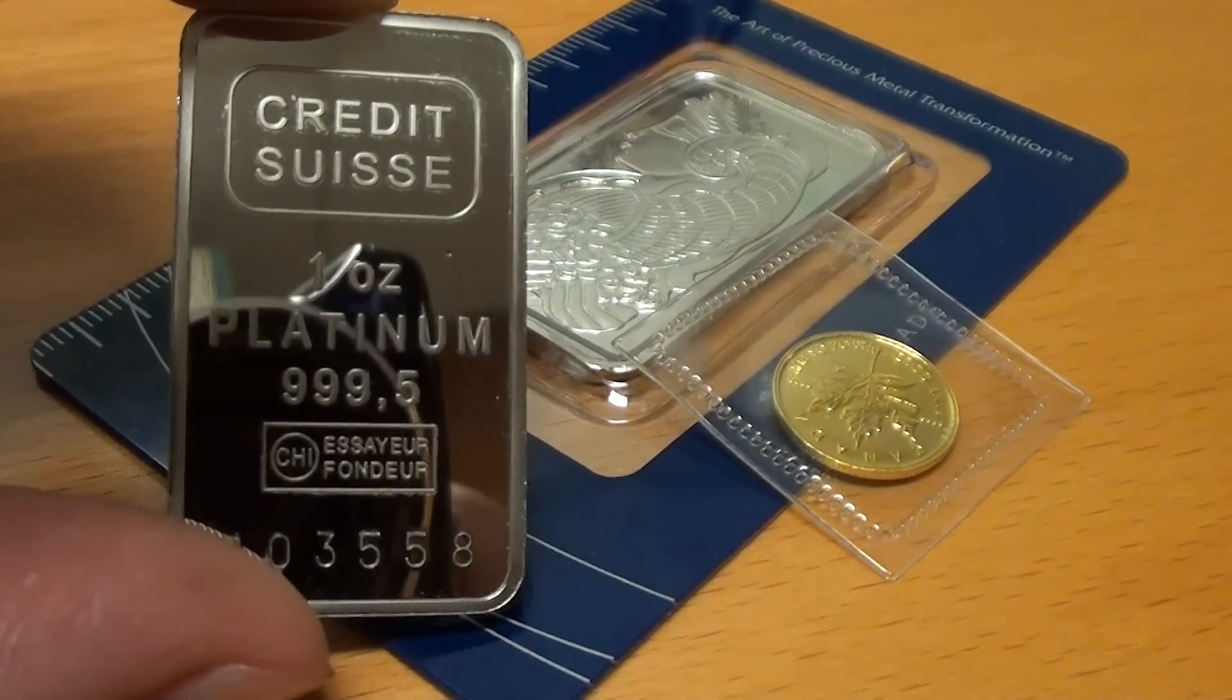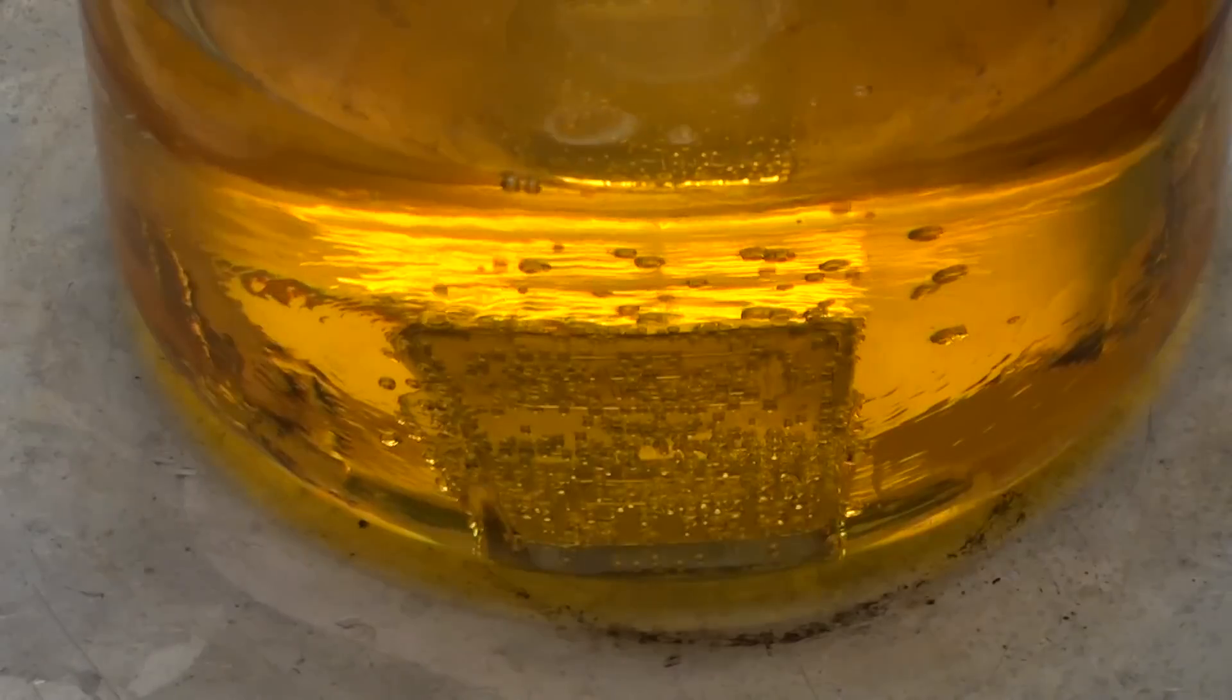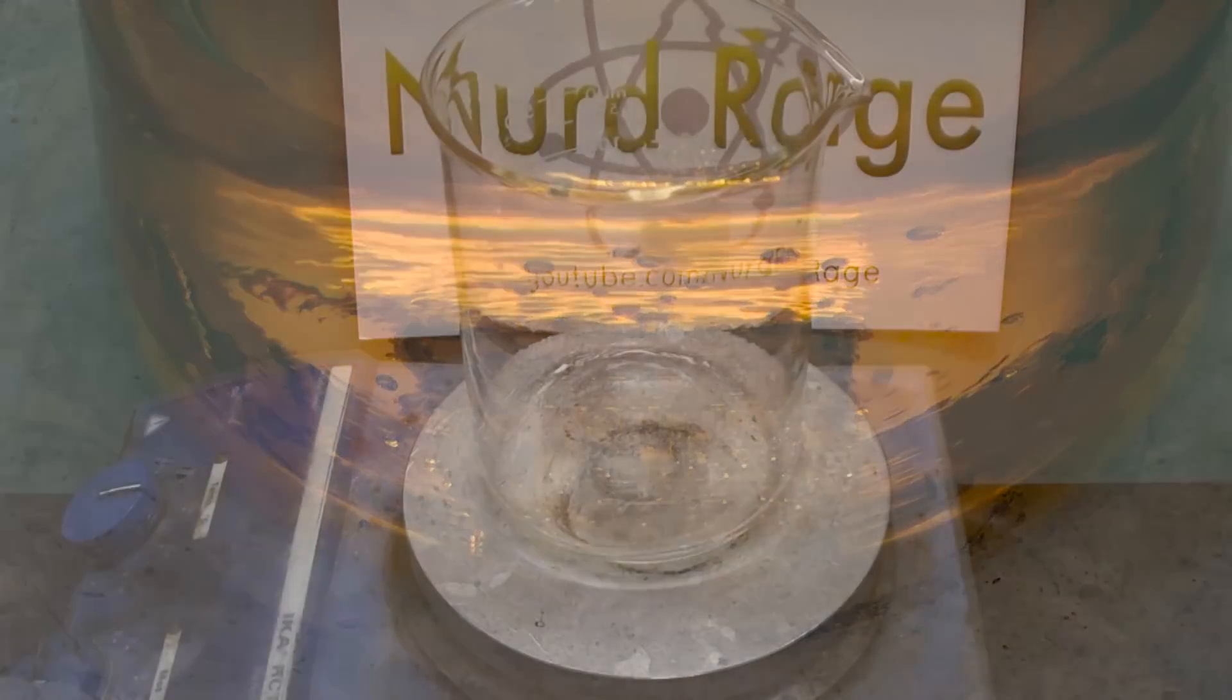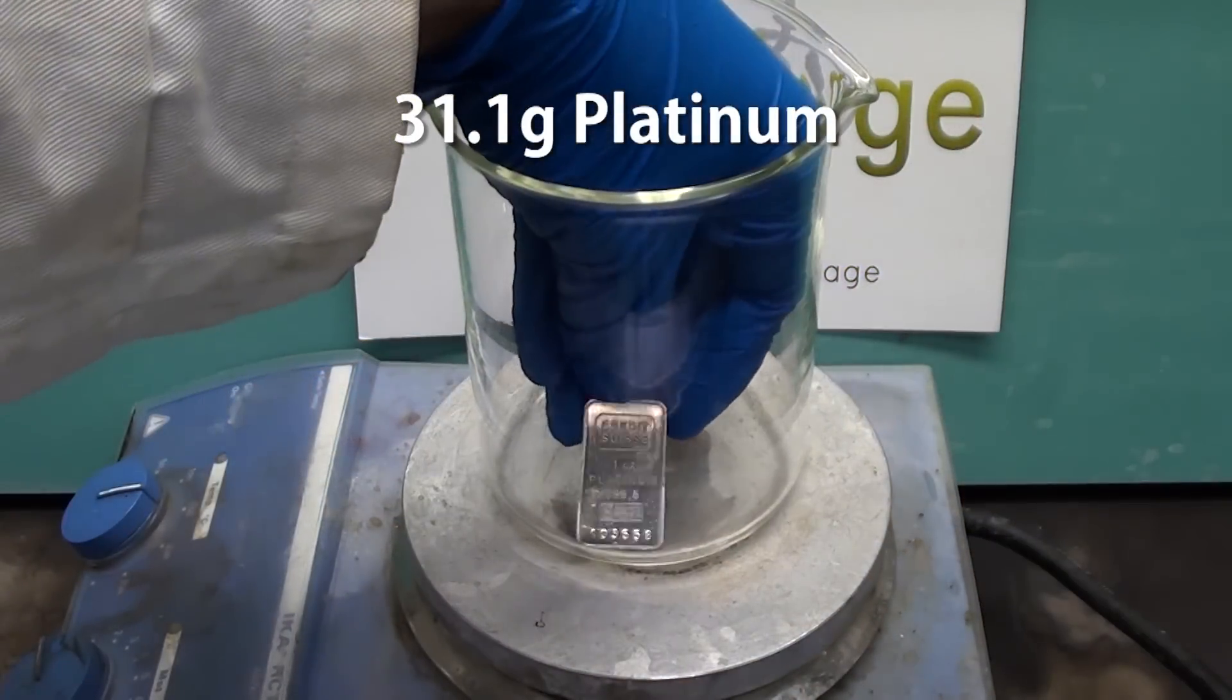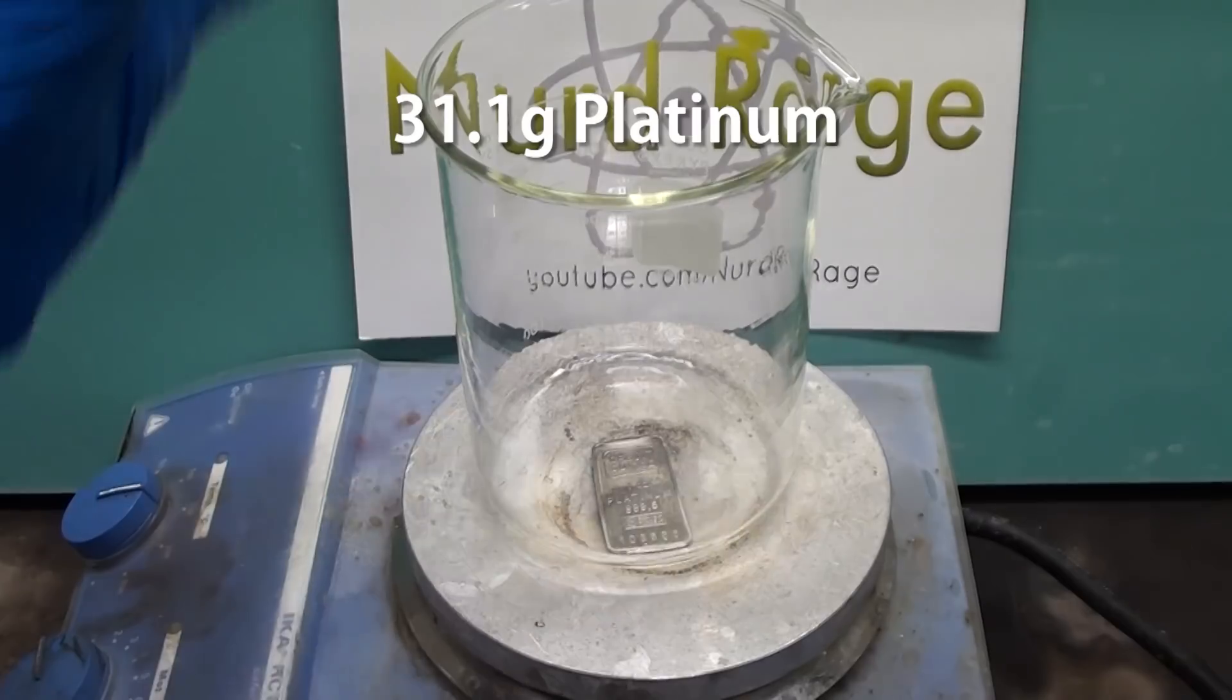In this video we're going to dissolve platinum in a combination of nitric and hydrochloric acids, better known as aqua regia. Here is the platinum bar weighing one troy ounce or 31.1 grams.